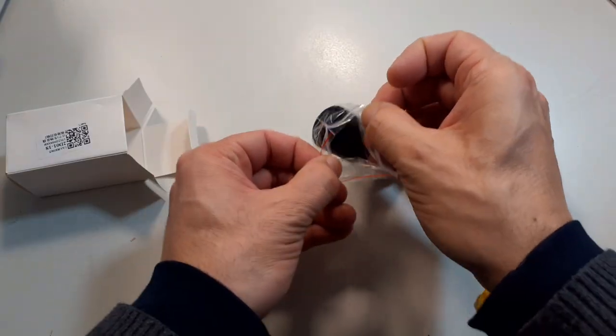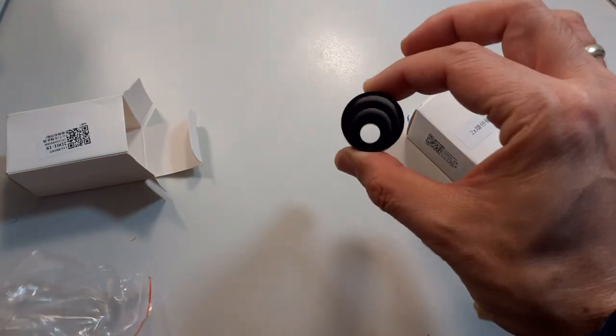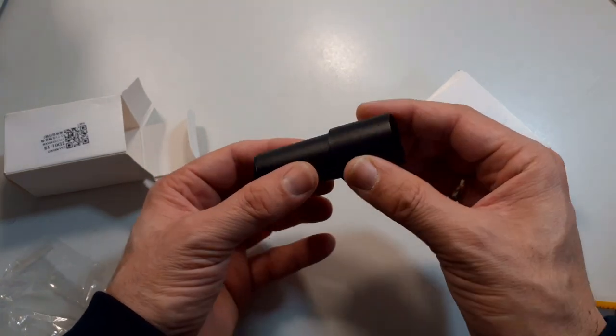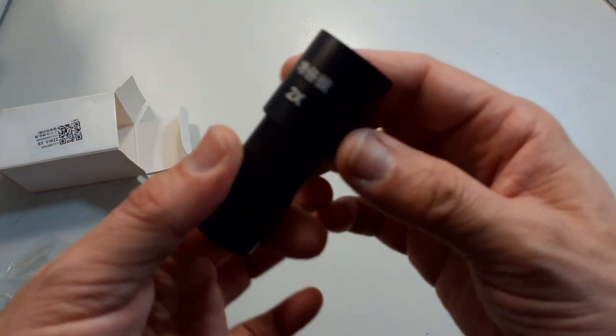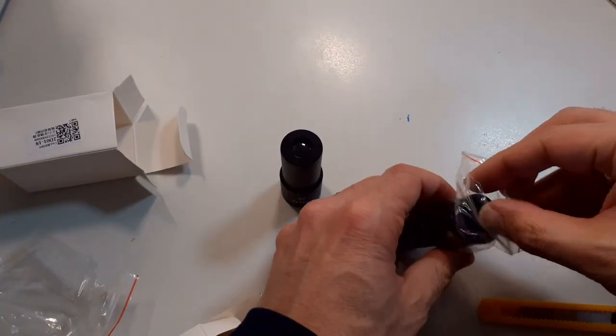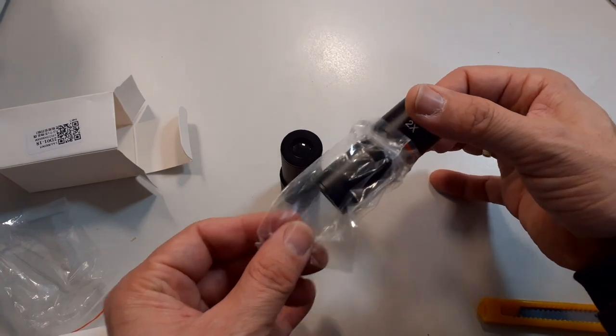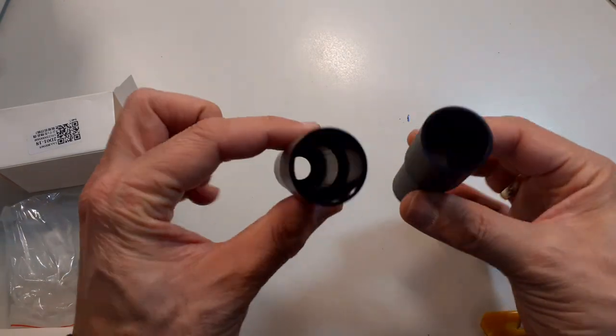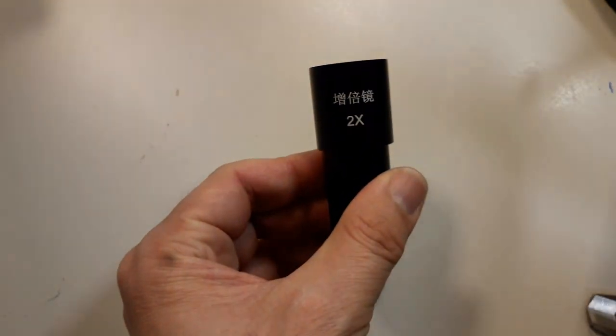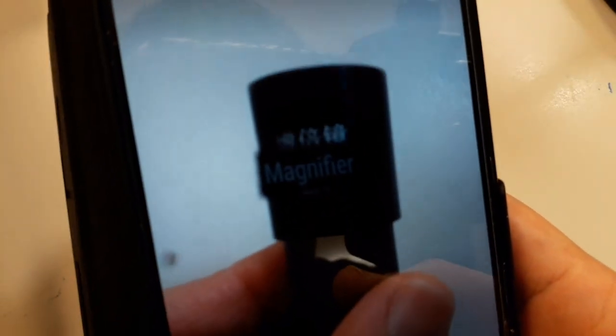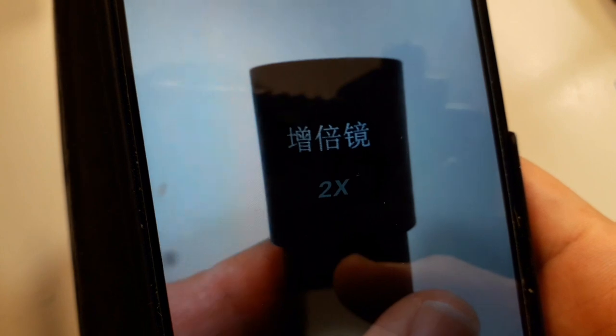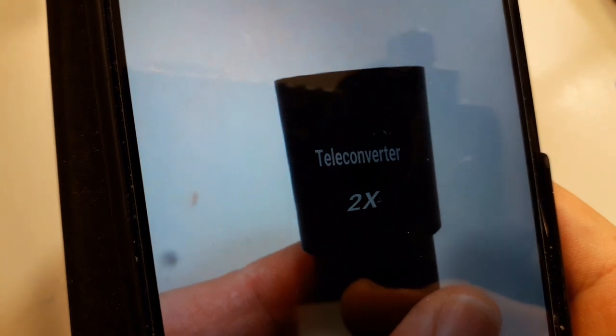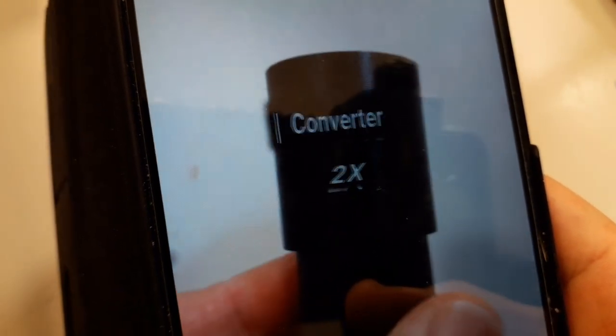The Barlow lens itself was made of quite high quality metal and you can see the lens from one side and on the other side you can insert the eyepiece. There was something written in Chinese which I did not understand but later I translated this using a Google Translate mobile phone app. The two times magnification is self-explanatory, but I used the app which superimposed the translation and here it says converter and teleconverter.